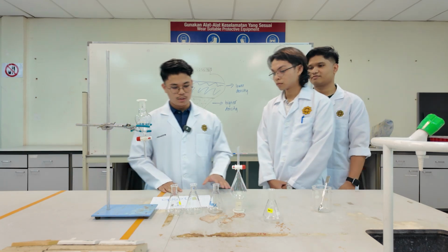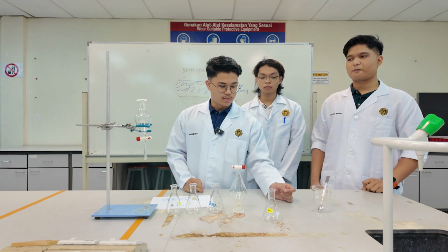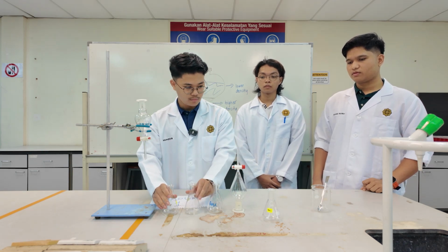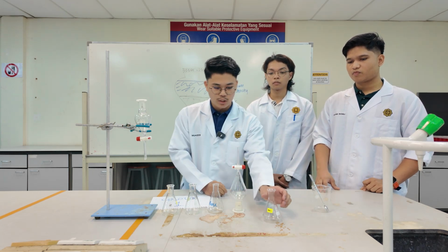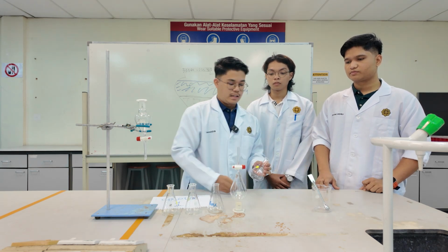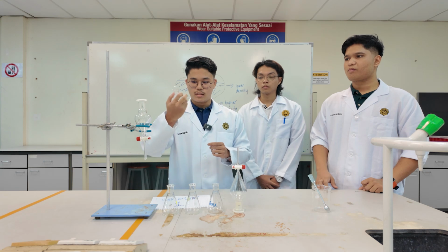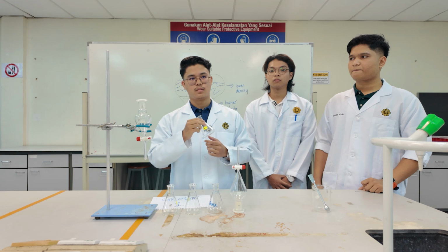So firstly, what we need to do is prepare the mixture. We need to take 0.2 gram of solid of each acid, neutral and base using a spatula, and put it in the mixture flask. After that, we add 10 ml of dichloromethane into the mixture flask and swirl it until all the solid is dissolved.